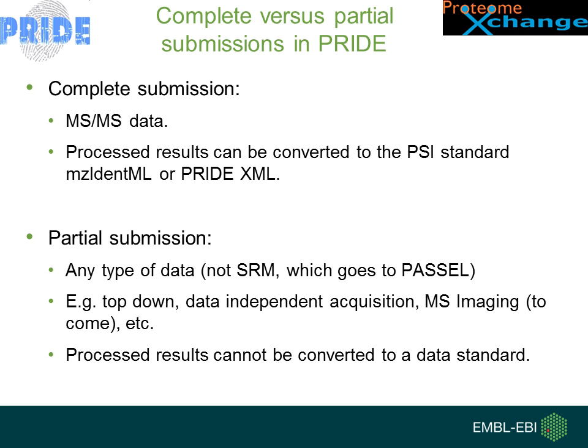And so we defined two submission types: complete submissions, where we can process the result files. They can be converted to PSI standard formats and can be made accessible to the community, fully parsable, fully searchable, and, well, as a good basis for reuse.